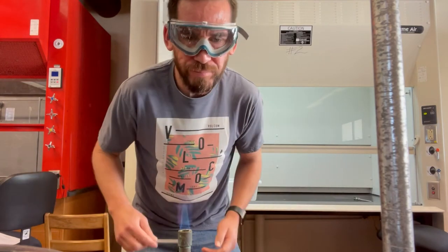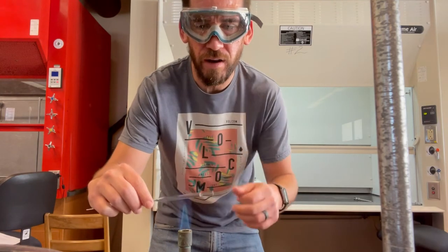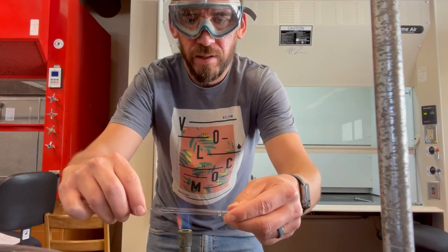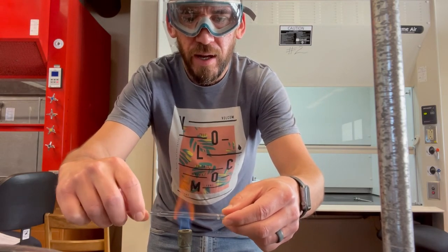For real? Got my flame right here. You see that blue cone zone? All right, so you want to be all up in that cone zone and spin it, spin it, spin it.